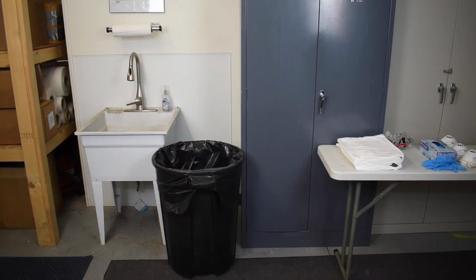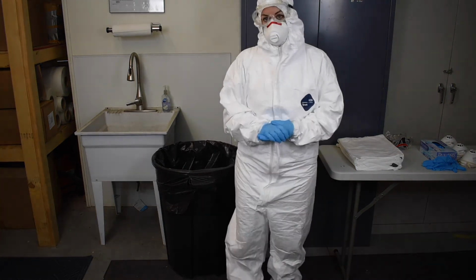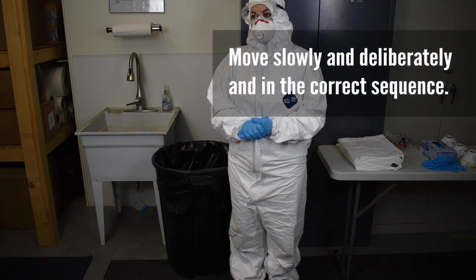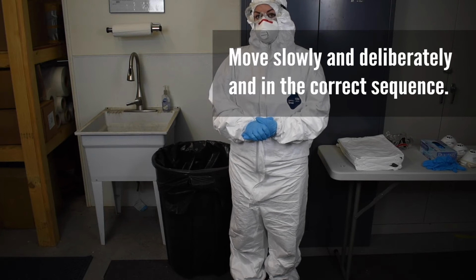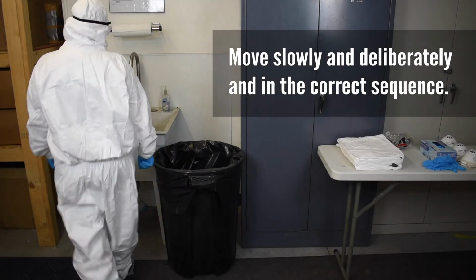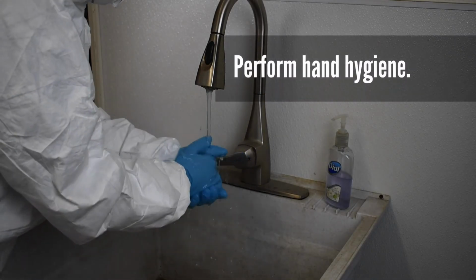First, while still in the patient care room, the healthcare provider must perform hand hygiene on the outer gloves prior to exiting the patient care room. Remember that doffing of PPE is a high-risk activity. It is critical to move slowly and deliberately and in the correct sequence to reduce the possibility of contamination. Upon exiting the patient care room, immediately perform hand hygiene.